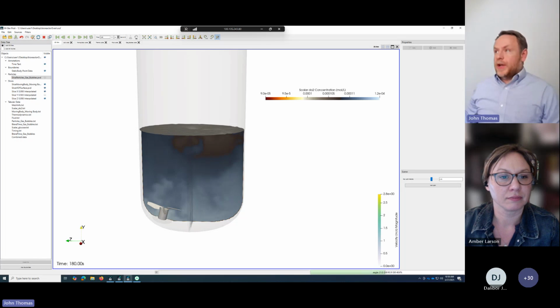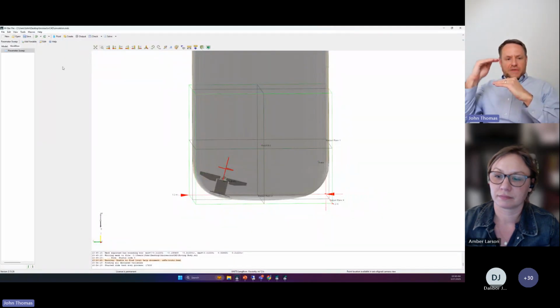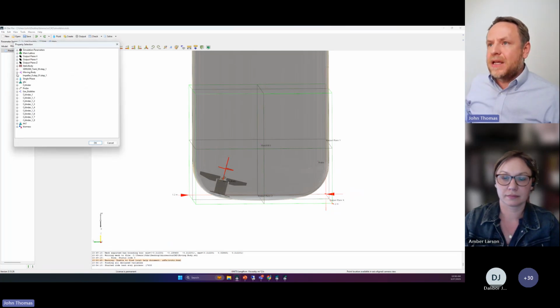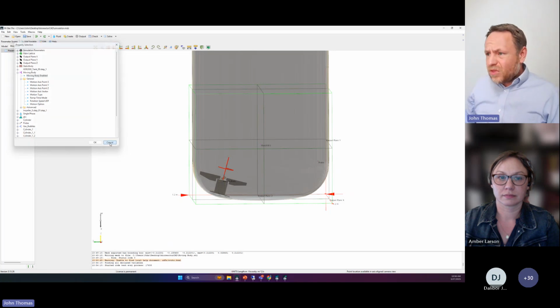You can do whatever you want to do. There are 2 ways to get at that. One way is to do a parameter sweep, where I can have the simulation march through a series of serial simulations or run them in parallel and edit where a system might be. So maybe I'll go to this guy and change the mount point, the motion axis, or any of these parameters associated with this guy. And then I can run a series of simulations.